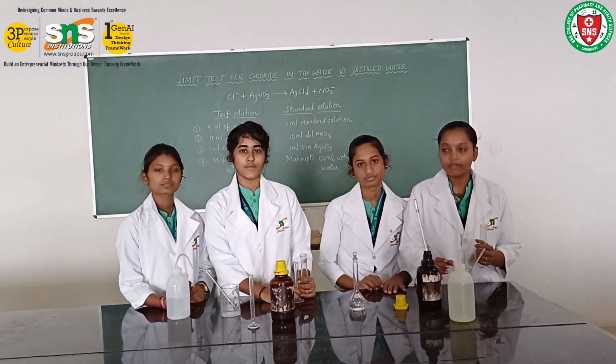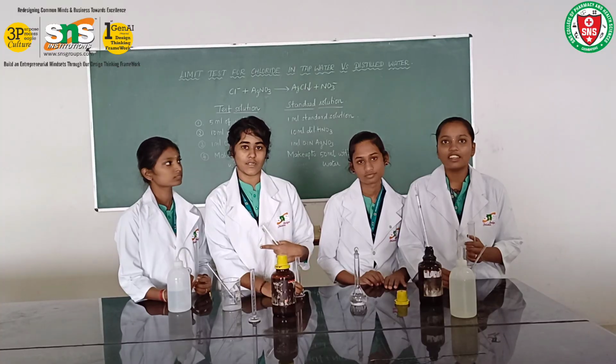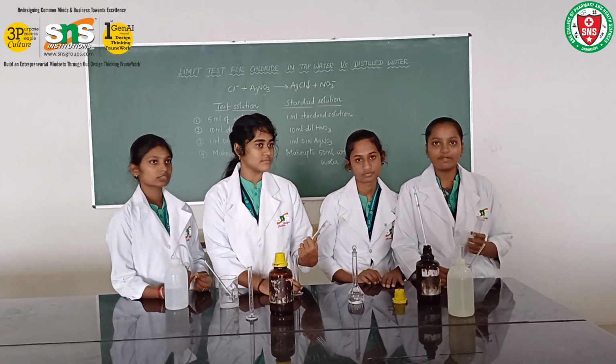So I have divided the students into two groups. One group will perform the limit test using tap water, and another one is going to perform the limit test using purified water or distilled water. So let's begin the experiment. We are going to perform the limit test for chloride using distilled water.